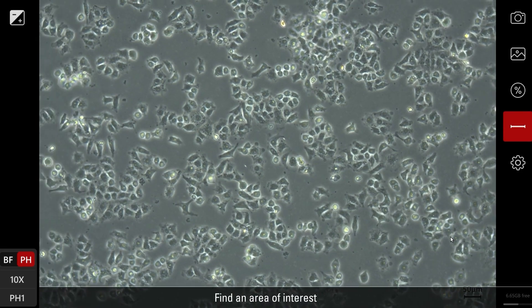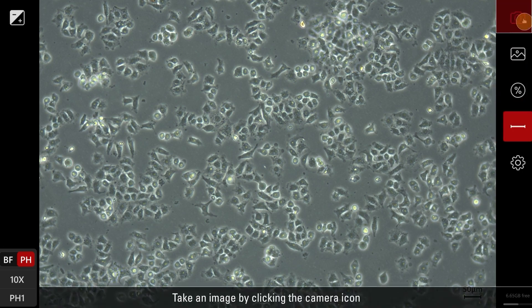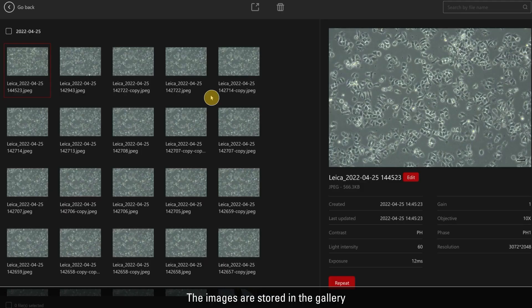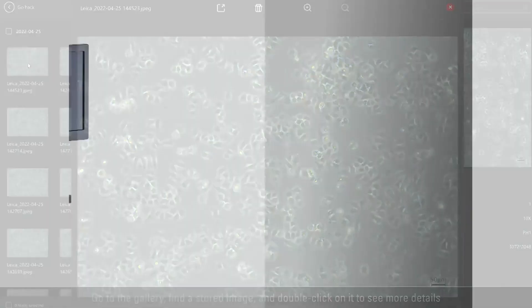Find an area of interest. Take an image by clicking the camera icon. The images are stored in the gallery. Go to the gallery, find a stored image, and double click on it to see more details.